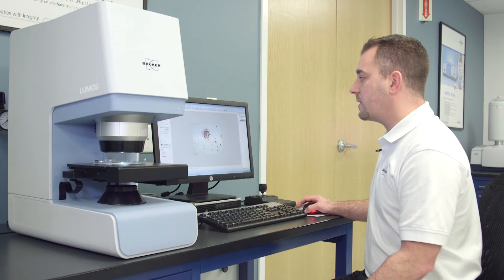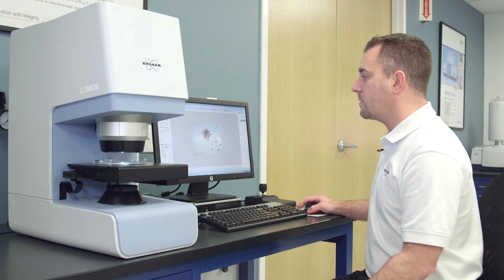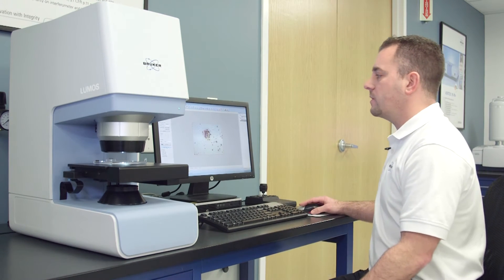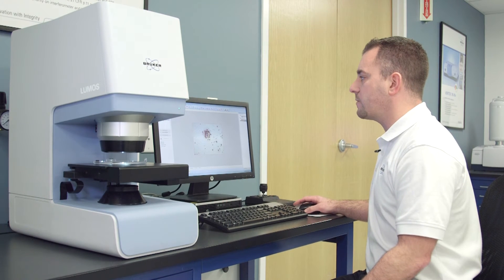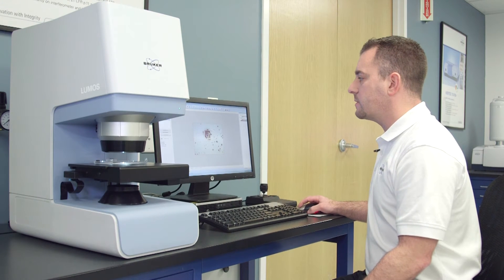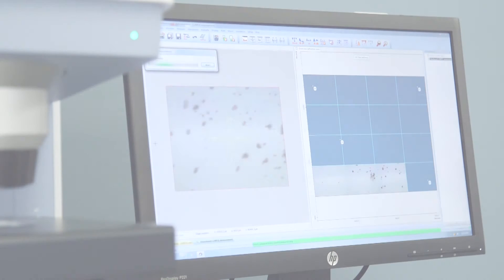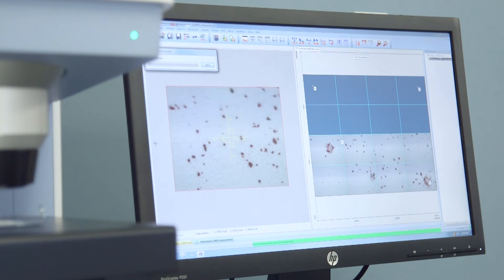I have autofocus and I have mosaic building of a larger area which I'm going to do because I want to see an overall picture of my particulates here. So first off, I'm going to come and I'm going to add a border point just so we can get an overall view of our filter paper.